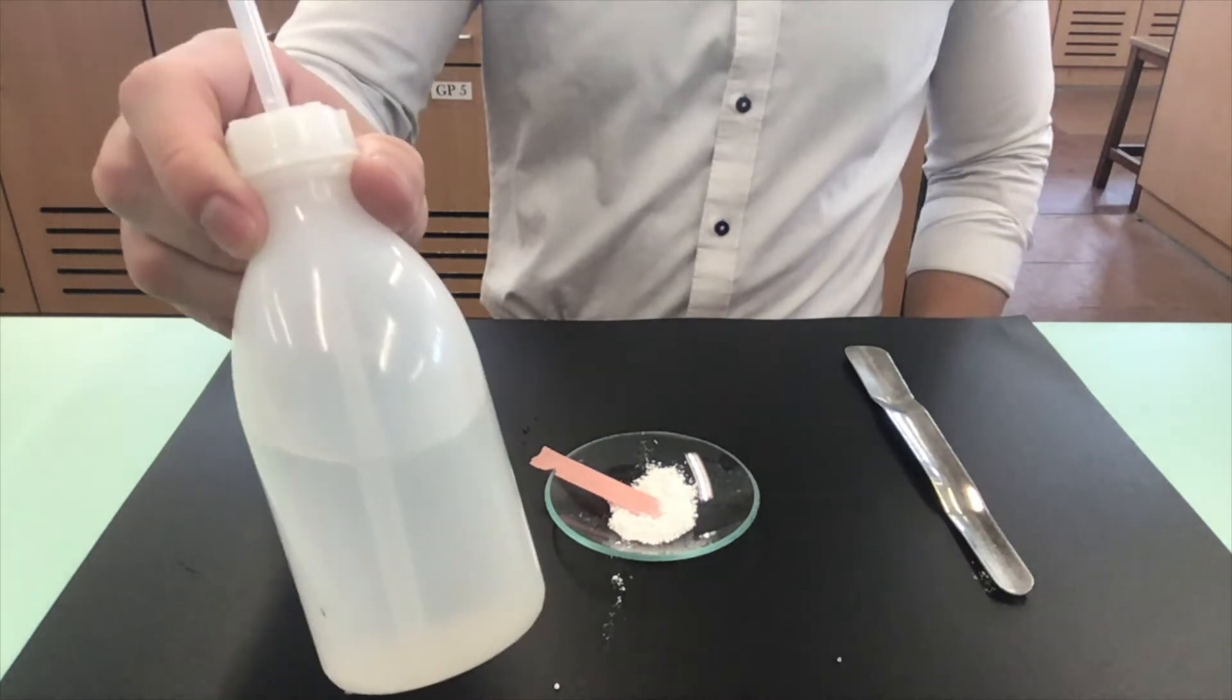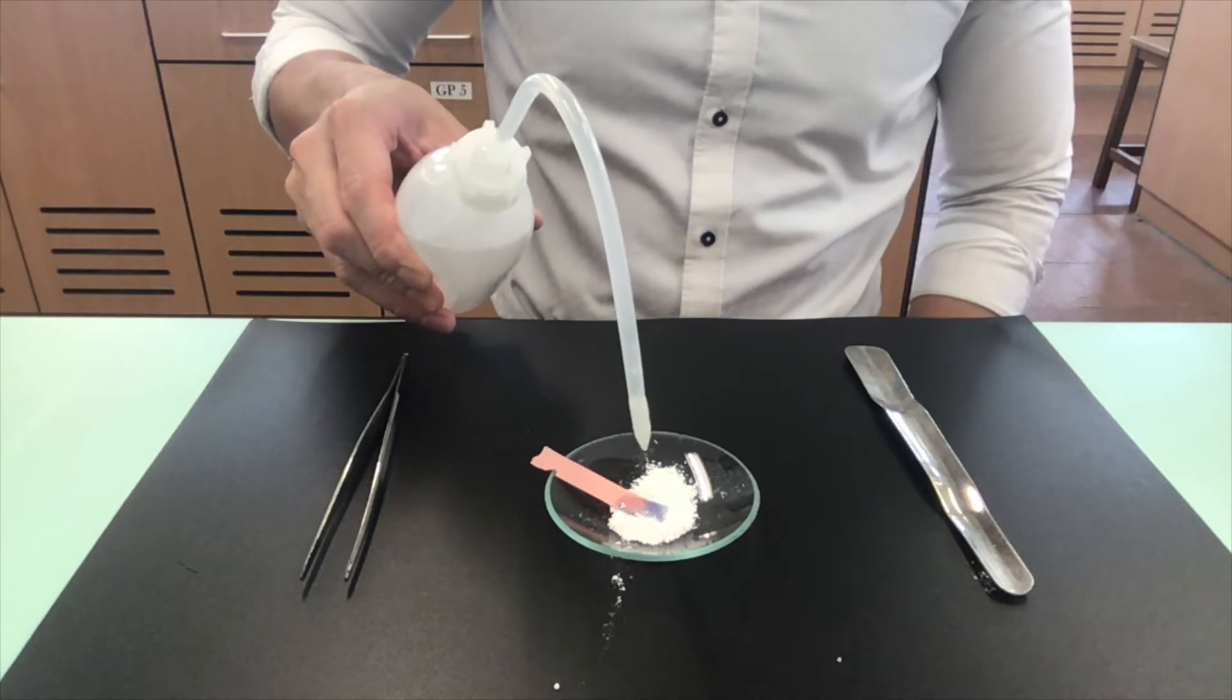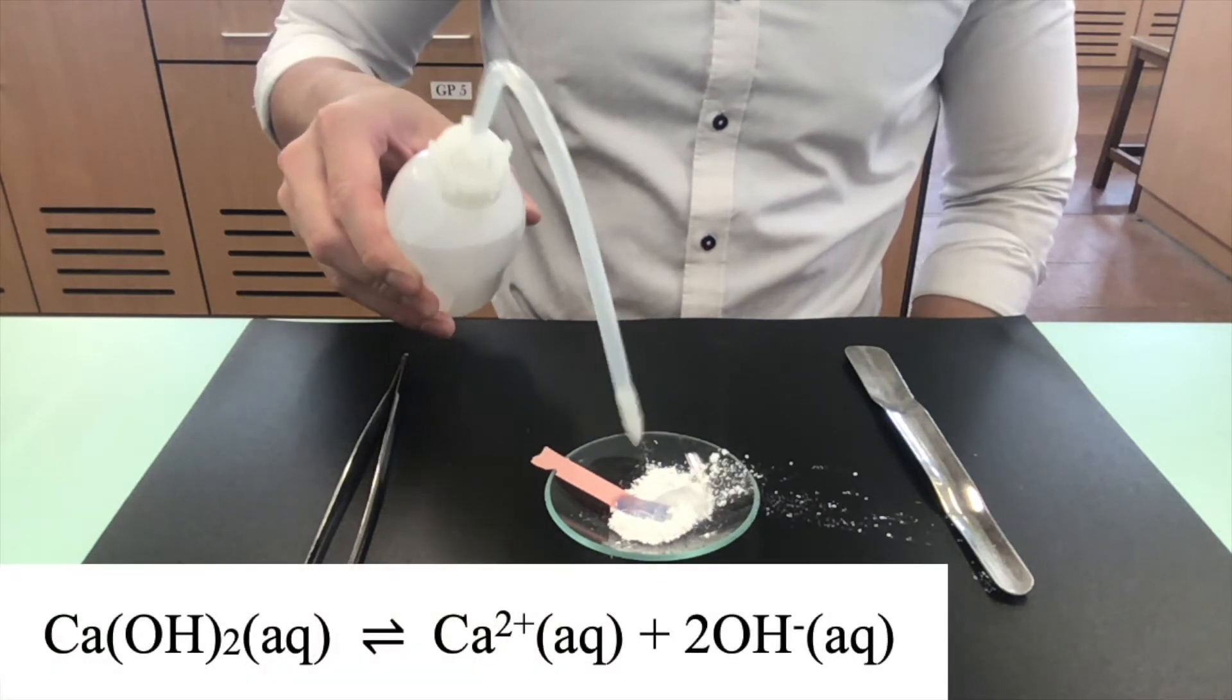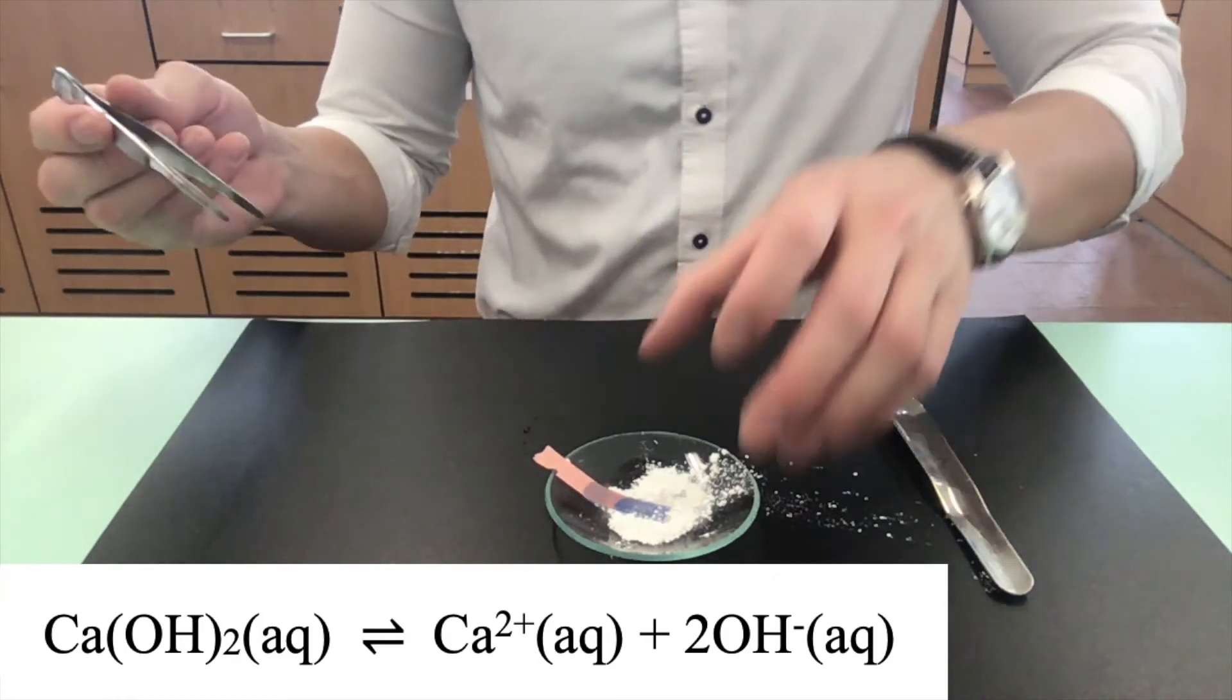We will now add distilled water to the sample. The red litmus paper turns blue. It shows that water is necessary to show the alkaline property of the alkali.